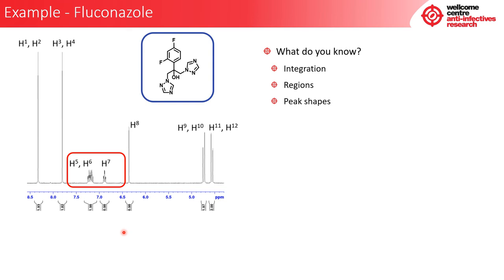What we could do is delve into the J coupling, blow up these peaks and measure the coupling between them, and perhaps find the distance between these two protons and be able to say which peaks are able to see one another. However, in this example, I want to also incorporate 2D NMR, so for this purpose, I'm not going to delve into that. However, it is a technique that you should use when understanding your 1D NMR spectra.